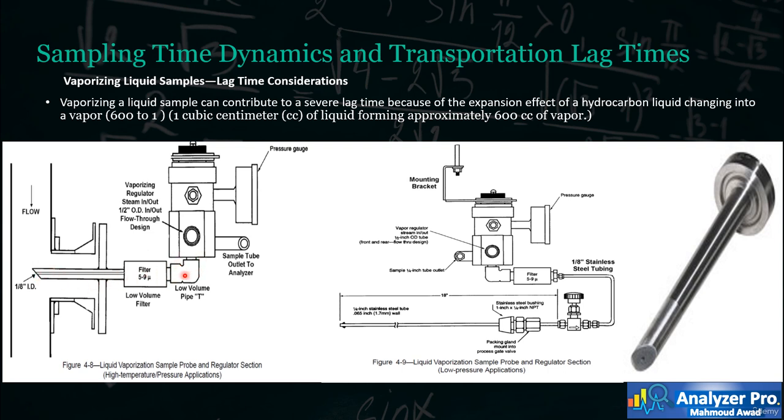Take care that partial vaporization might occur if the liquid volume flow is not sized properly for the vapor flow rate. To avoid the large dead volume, it may be advisable to drill a 1/8 inch hole through rod stock welded to a flange to use it as a sample probe. Also, as shown in this assembly, the filter and fittings are also low volume. If a tube between the sample vaporizer and the sample probe must be used, it is preferred to be of the smallest size possible. In this assembly 1/8 inch tube is used.